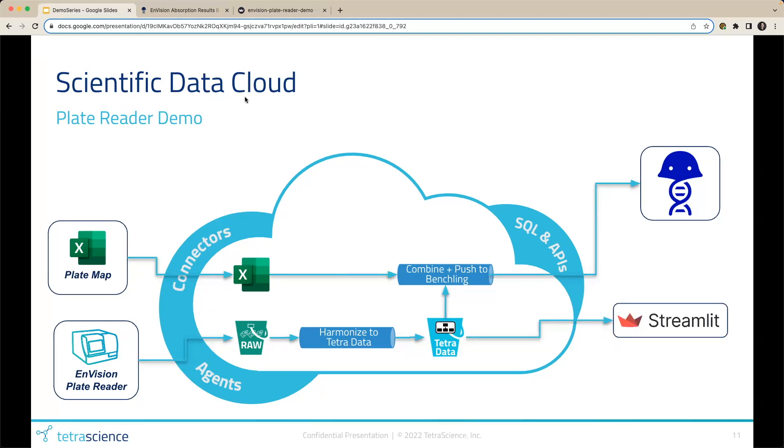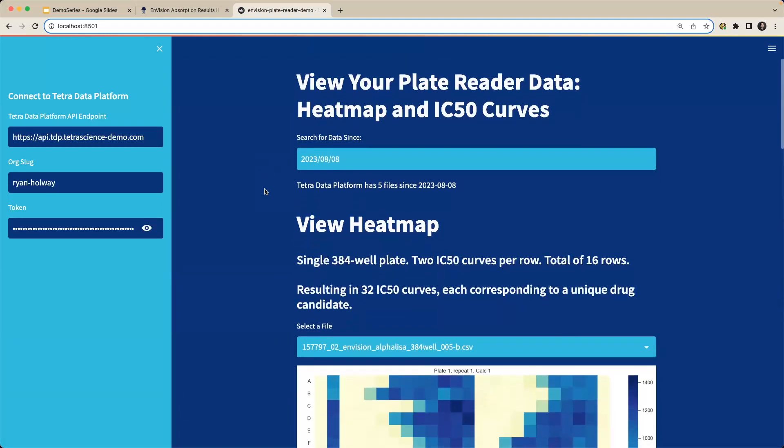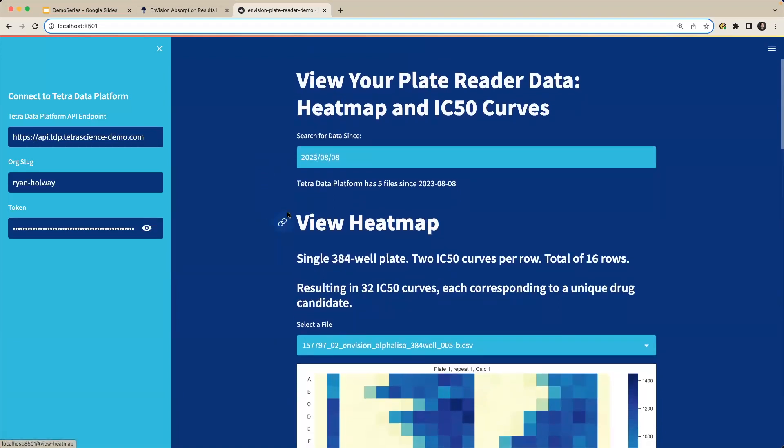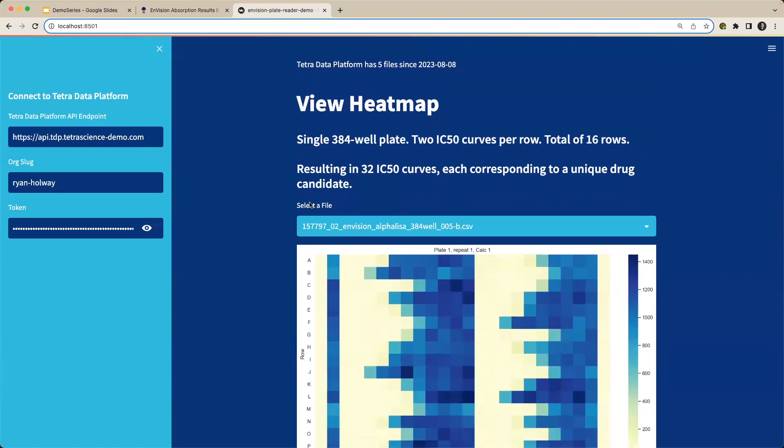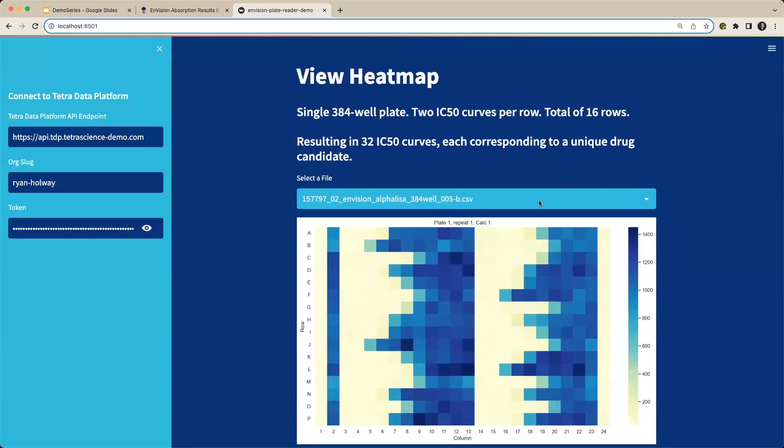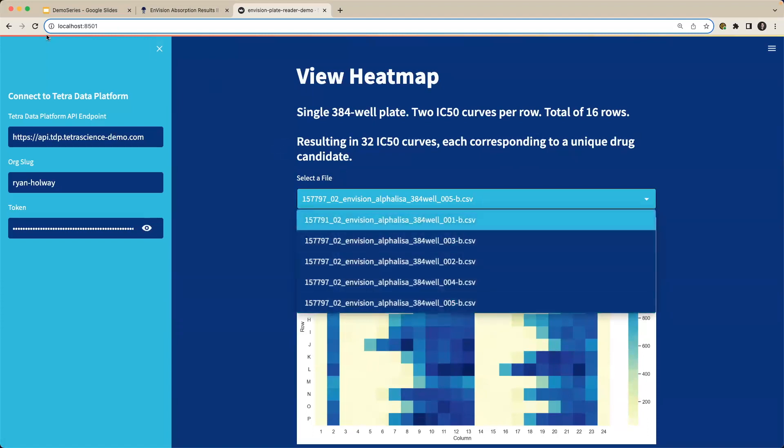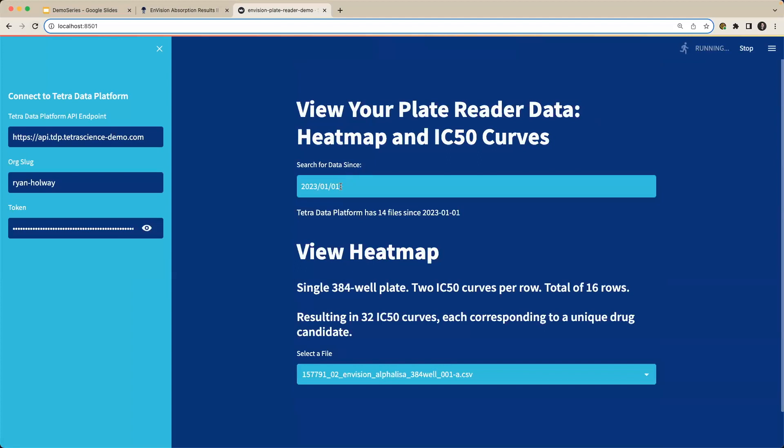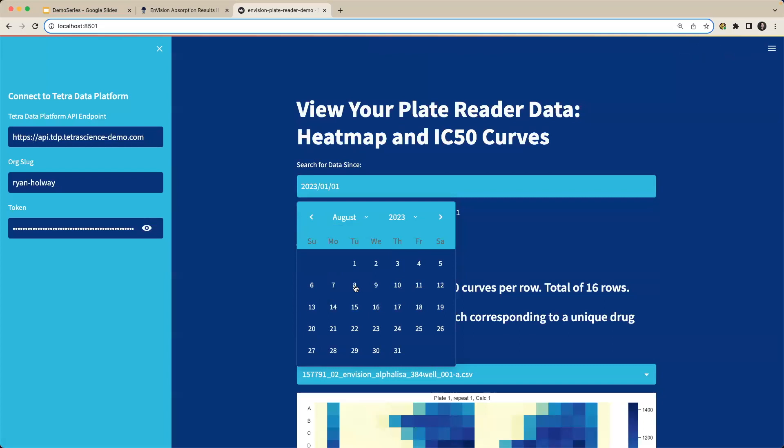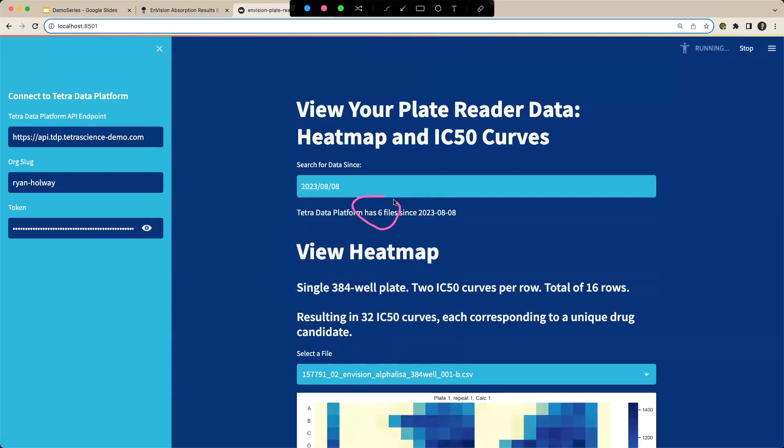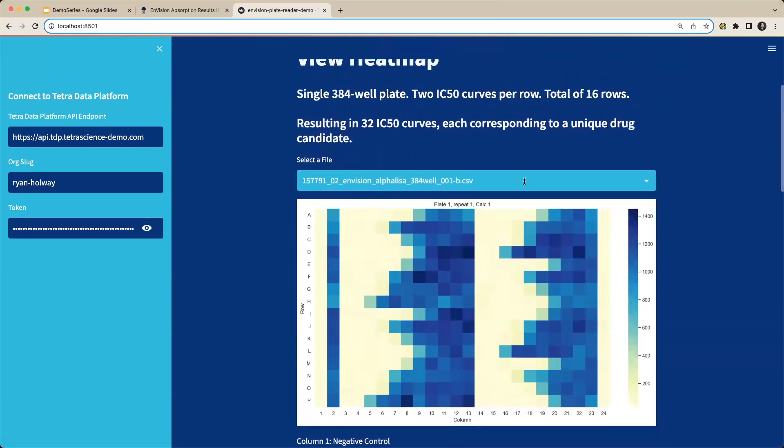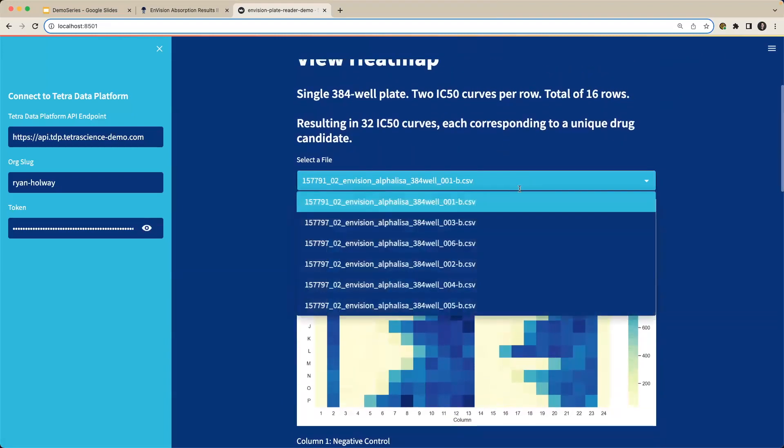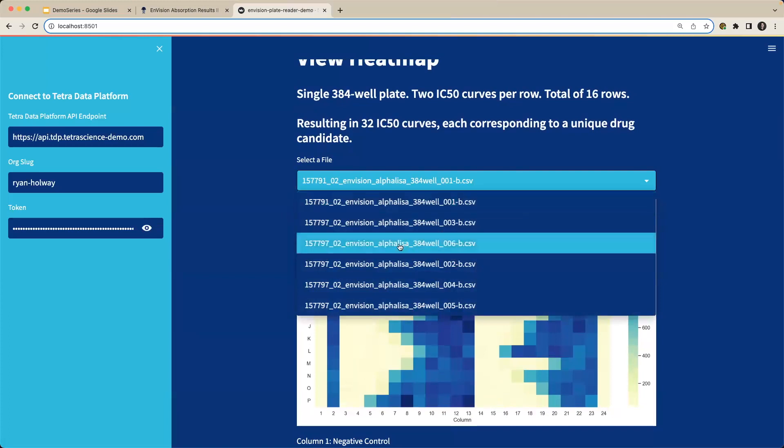So I will jump over to that Streamlit application. And here we're able to view our plate reader information as heat maps and IC50 curves. I'm able to specify the dates I want to search the platform for. And I can look at my heat map based on the files in the platform. So if I refresh the page, I want to look at data since August 8th, 2023. And we have six files since then. And I'd like to select a file. And we saw that file that we ingested onto the platform was 006-B. So I'd like to select that file.